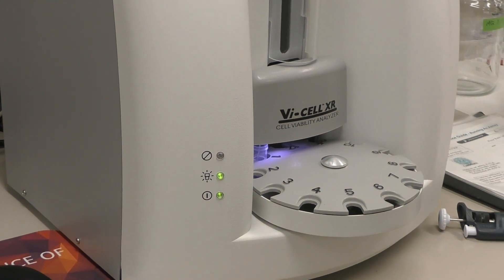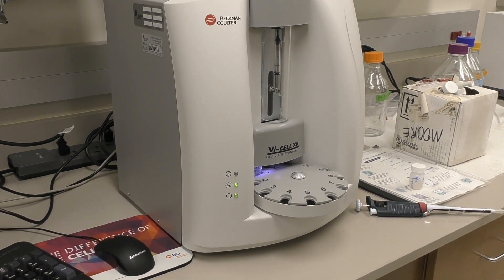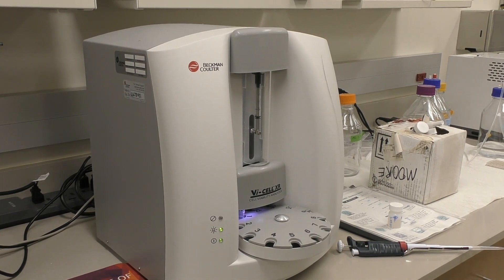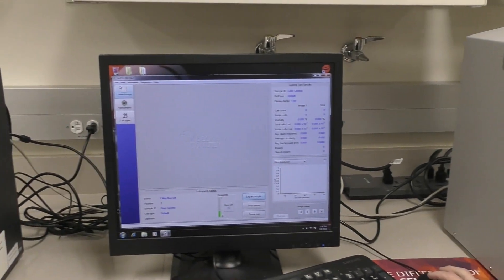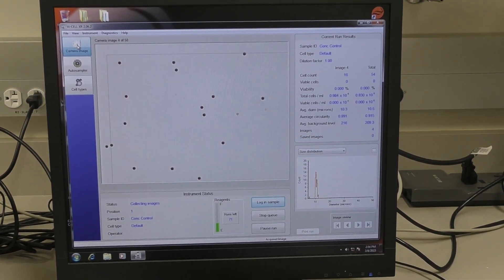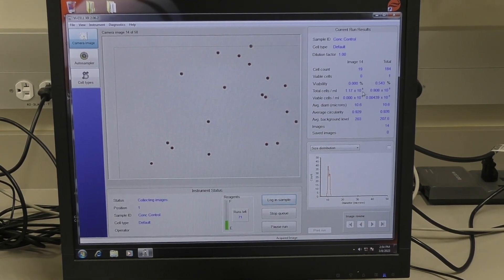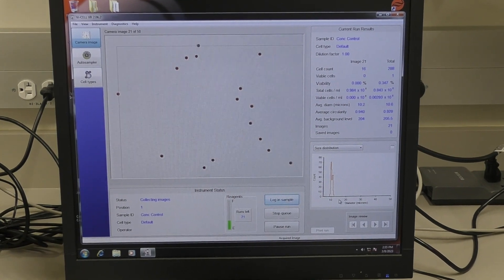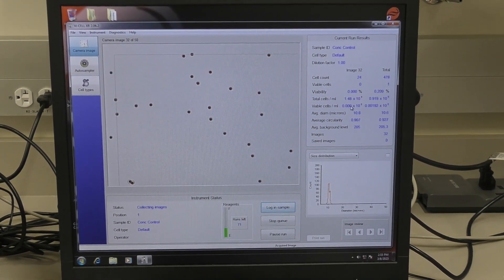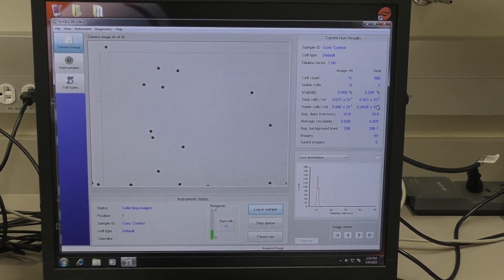The instrument will aspirate your sample, add the Trypan Blue mix, and take 50 images, giving you the total cells per ml — both in the current image and the total. It will give you approximate diameter in microns, and it will also give you viable cells per ml, both in the image and the total.